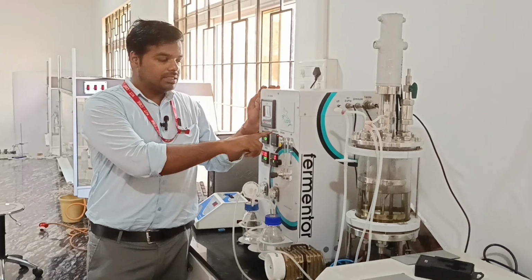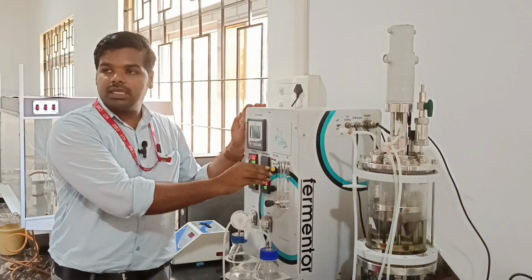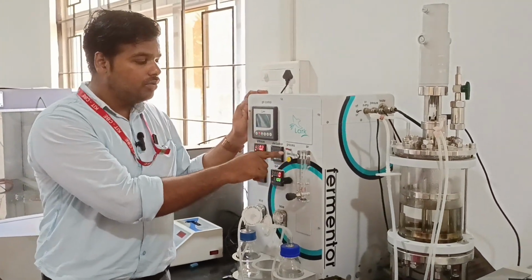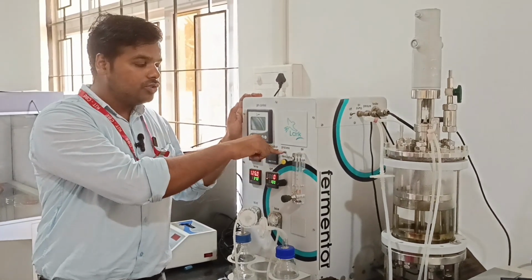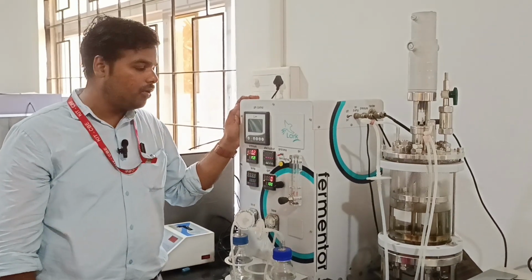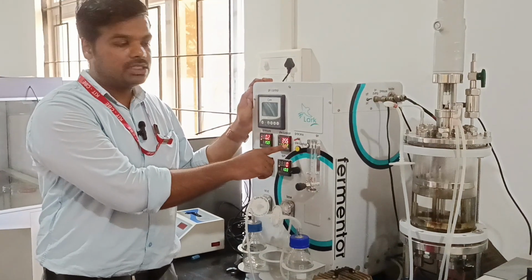See the sterilization panel in the control panel. So this is the control panel. We can control the sterilization here. There is a knob for controlling the process of sterilization. So we need to switch on the sterilization and press this button. The sterilization will now be on. You can see the current temperature, like 35.6 degrees Celsius.